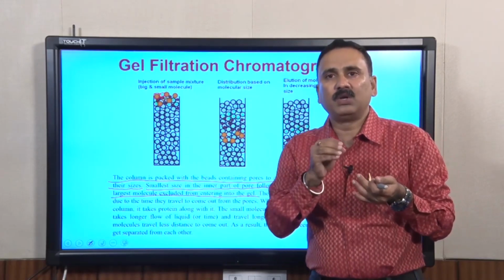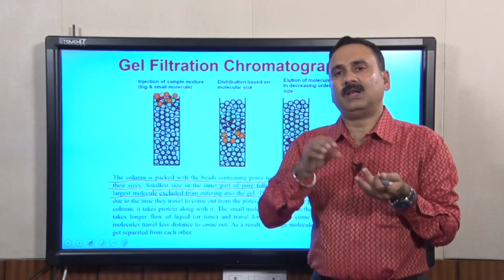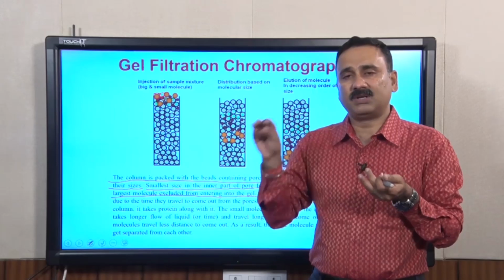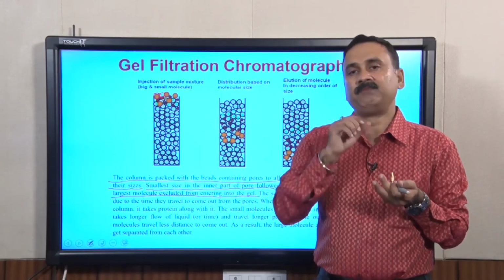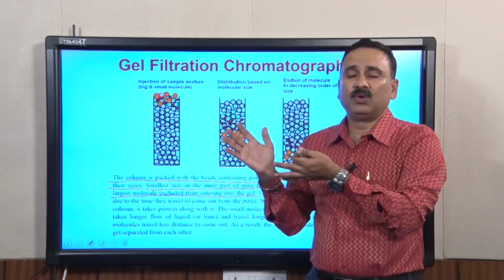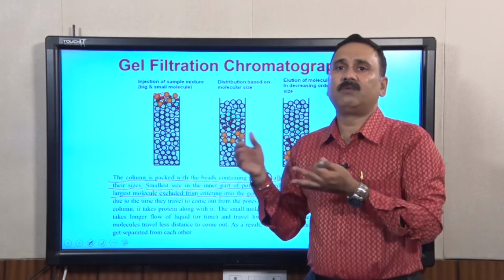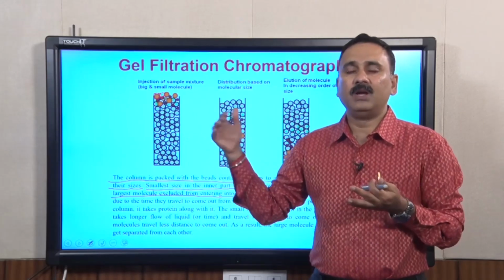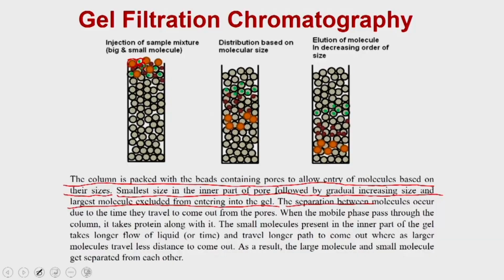the smallest molecule is going to sit at the bottom of the pore, whereas the larger molecules are going to sit on top of these small molecules, and the largest molecule which will not enter into the pore is going to be excluded from these pores, and that will remain in the buffer phase. The separation between the molecules occurs due to the time they take to come out from the pore.